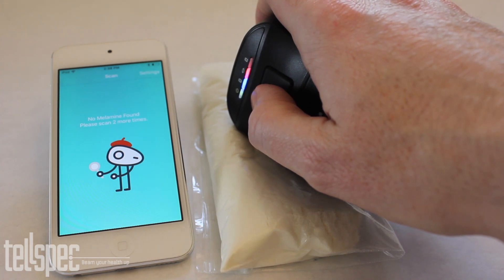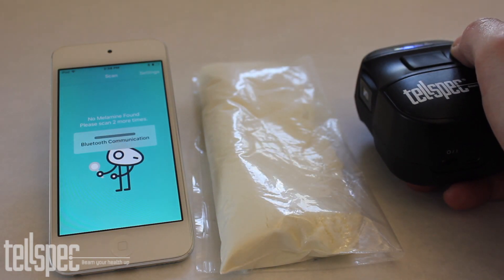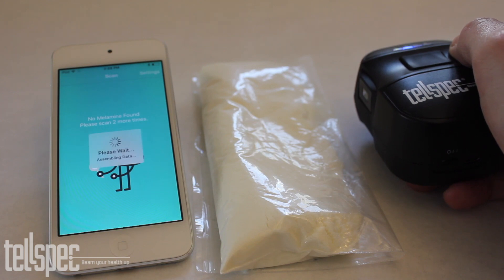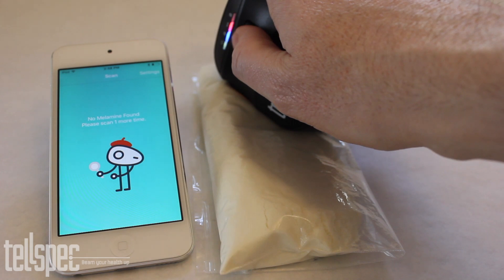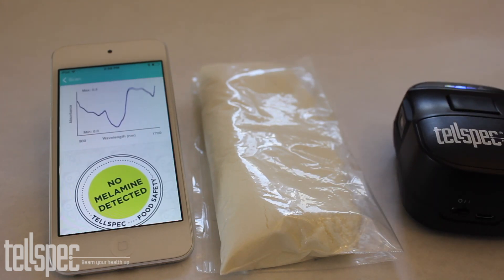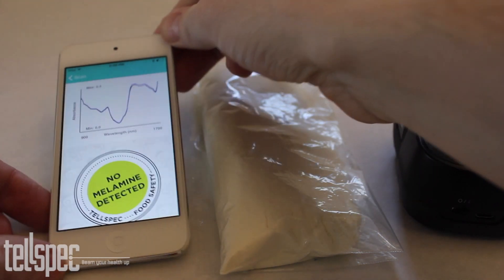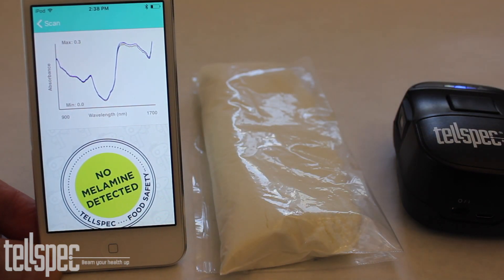We pick a different point on the baby food and scan again. The information is sent up to the cloud, the analysis is done, and the result comes back that there is still no melamine. We try a different spot for the third and final time. From all three scans no melamine was detected, as shown on the screen along with the spectral chart.